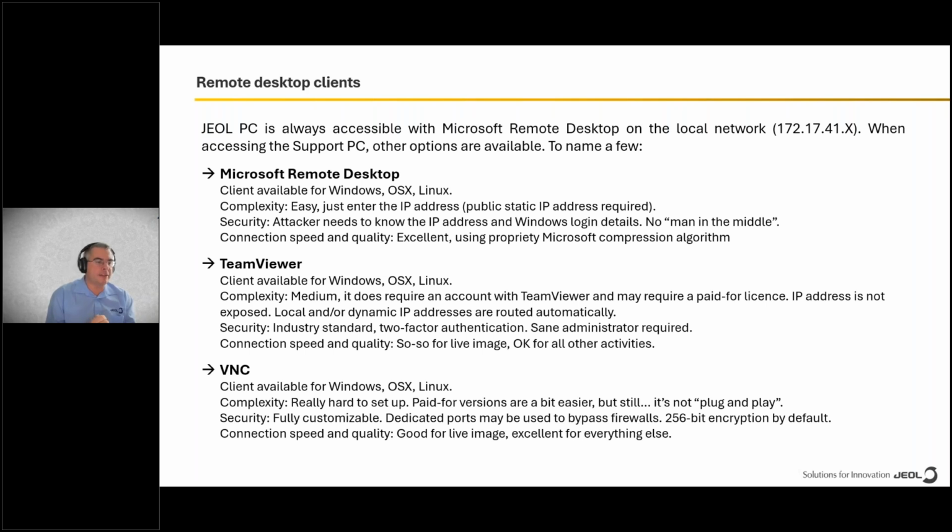The industry standard that we are using inside Jeol and we also promote to our clients is TeamViewer. And just to say, we do not have any kind of agreement with TeamViewer to support them. It's just that after COVID and after working remotely for many, many months, we found TeamViewer to be one of the most reliable tools that do the job.